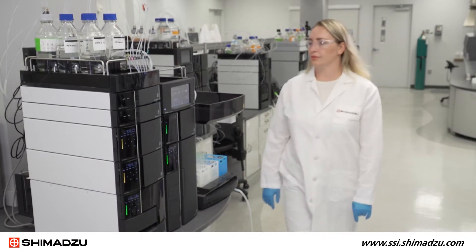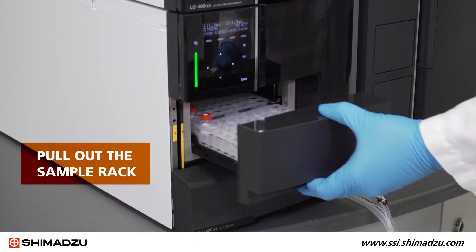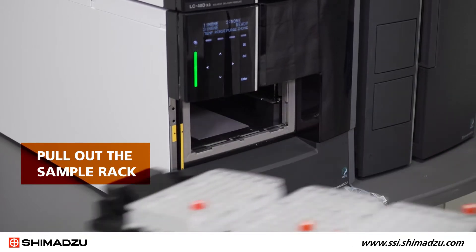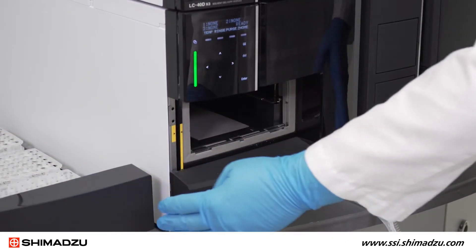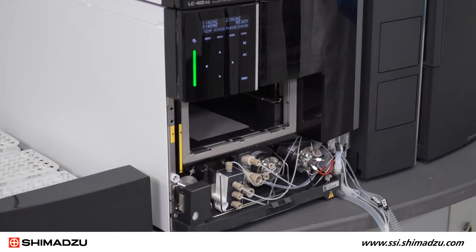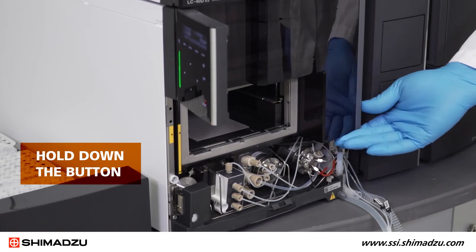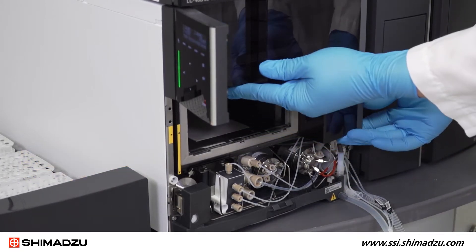First, you must remove the front panel of the Auto Sampler so that you can see the needle. Start by pulling out the sample rack and setting it aside. Then pull off the bottom panel and set it aside. To remove the front panel, swing the keypad out, then hold down the button at the lower right as you lift the panel off.